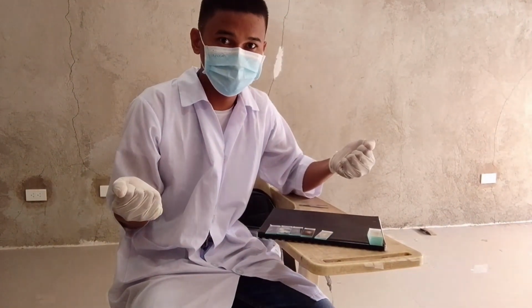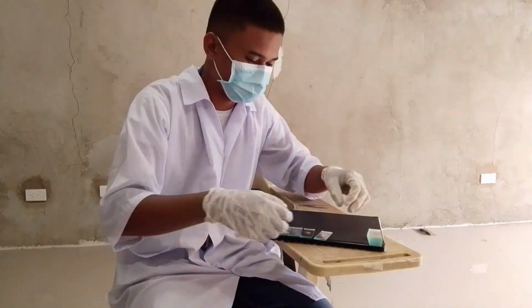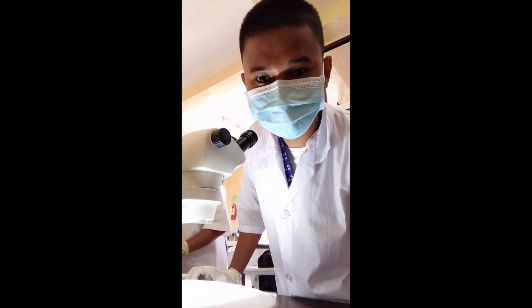I will now proceed to the microscopic examination of human and animal hair.